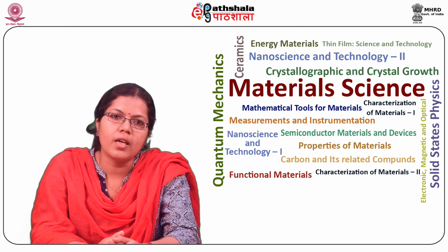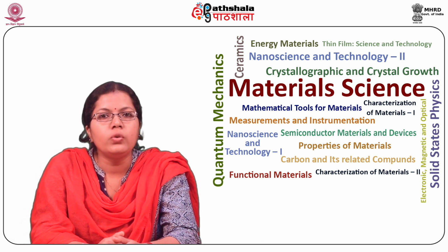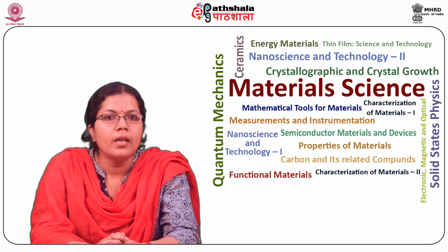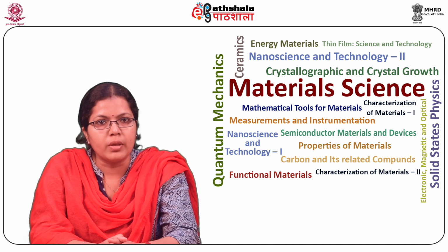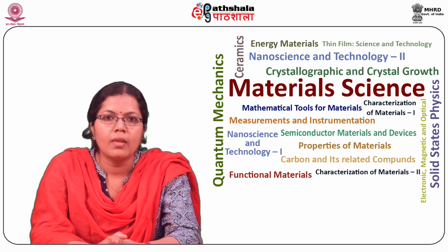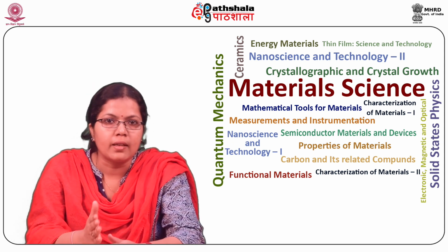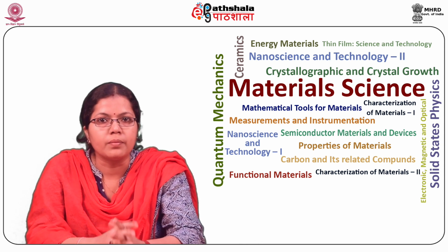The specimen stage normally takes in a sample of 2.3 or 3 mm diameter, either mounted or supported by copper, carbon, or beryllium grids. The specimen stage has facilities for tilting about one or two axes and rotation.